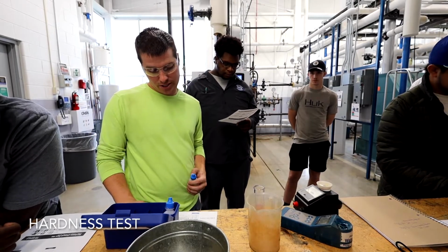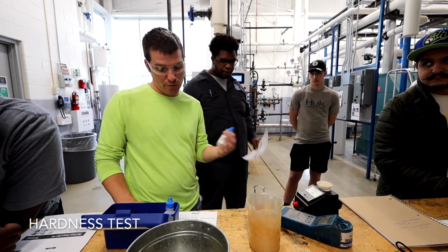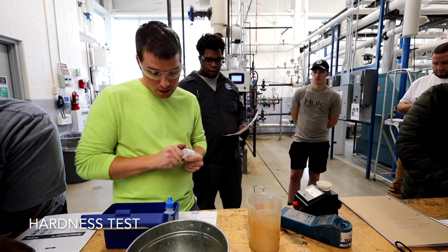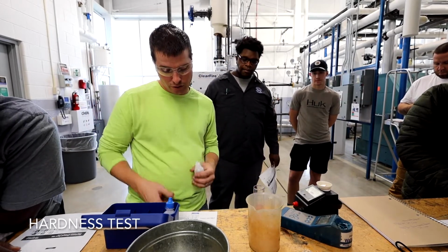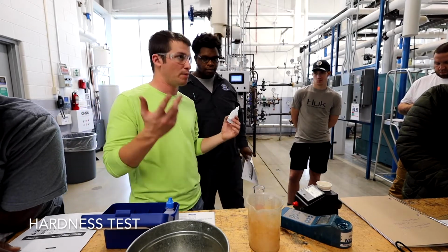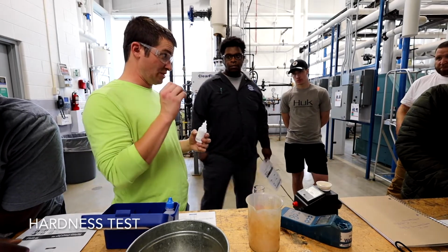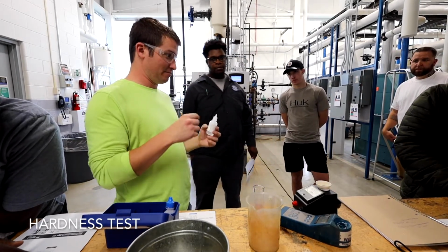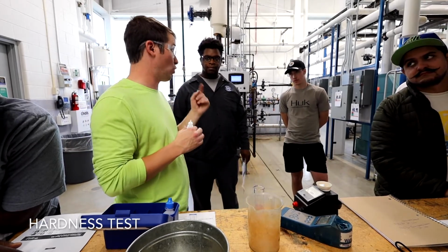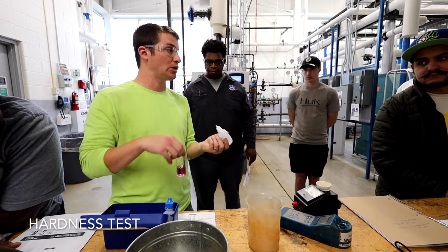Add trace hardness titrant, 1 drop at a time while swirling. Count the number of drops until it goes from that red, pink, purple, whatever, to blue, all right? And in a boiler, we're looking for 0. Each drop is only half a part. So if I add 1 drop, I have 0.5, 2 drops, 1, right? There are test kits out there where 1 drop equals 10. But in a boiler where I want 0, I ideally don't want to go over 1. 1 max is typically my control limit, before I say, okay, I've got to look at what's going on.